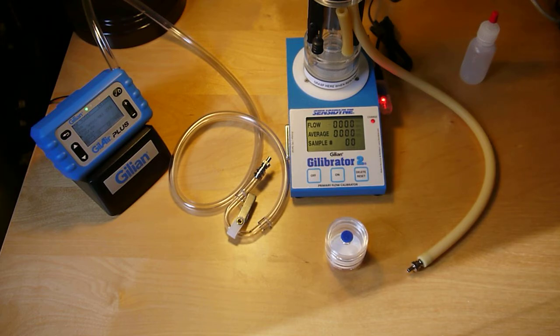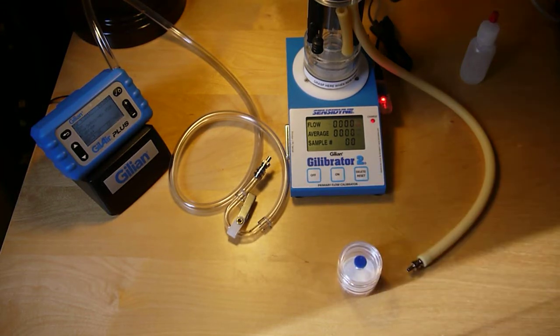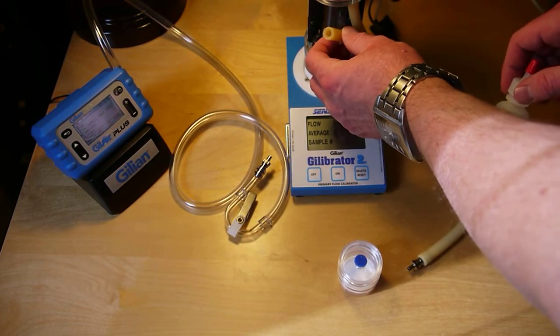This video covers how to calibrate a Gillair Plus sample pump with a Gillibrator 2. The first thing I've done is set up the Gillibrator 2 and used some of the soapy solution, loading it through this tube.